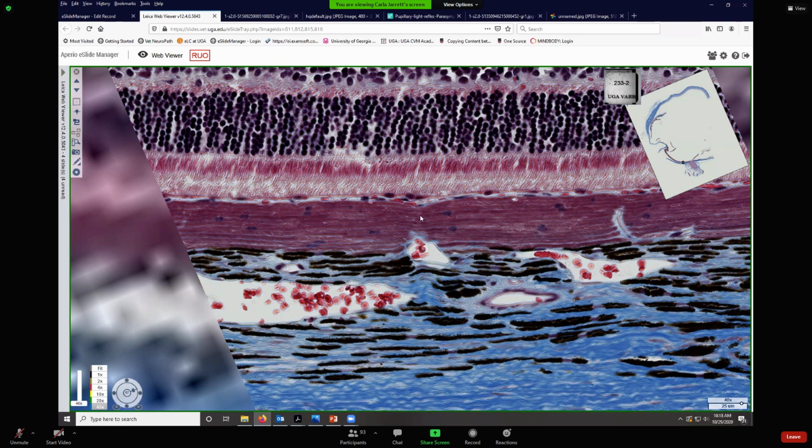And then I can see kind of rectangular shapes. And that tells me these rectangular shapes are like bricks in a building. I have an older house that was built in 1965, and it's got bricks on the outside, and they're really long bricks. They're not your typical size. They're not standard. They're larger, longer bricks. And this reminds me of the brickwork on the outside of my house. So this is called a cellular tapetum, where you can see these bricks.